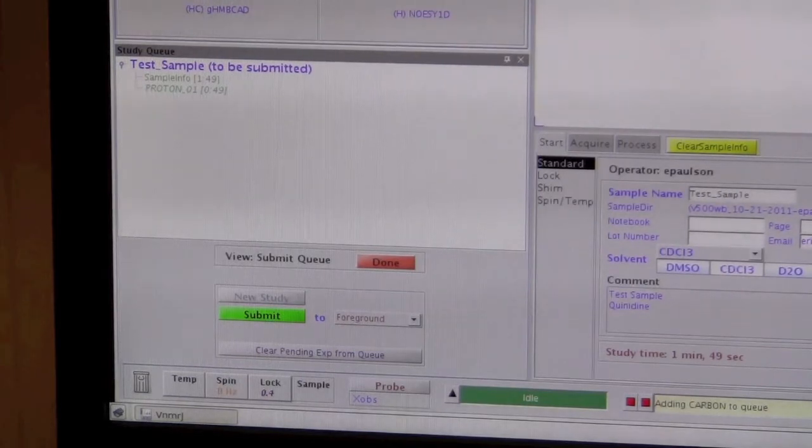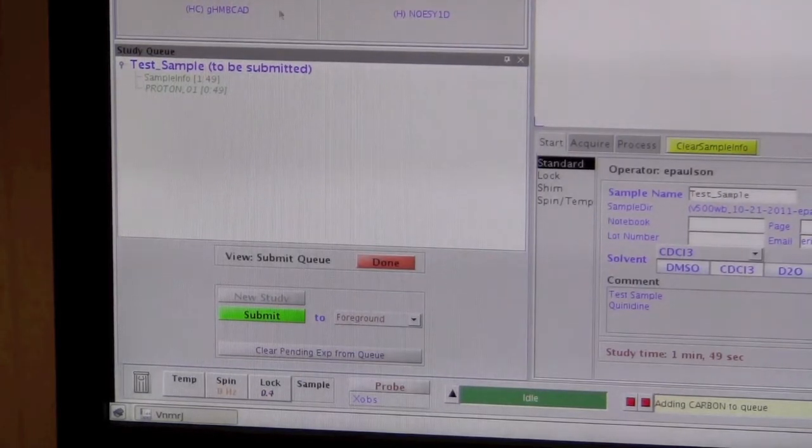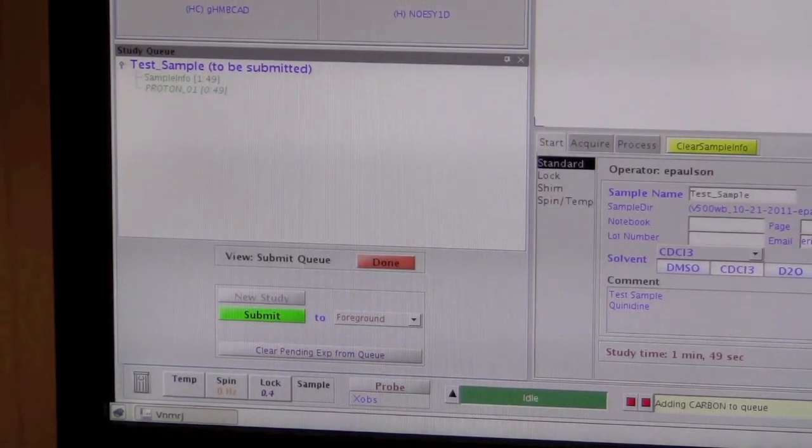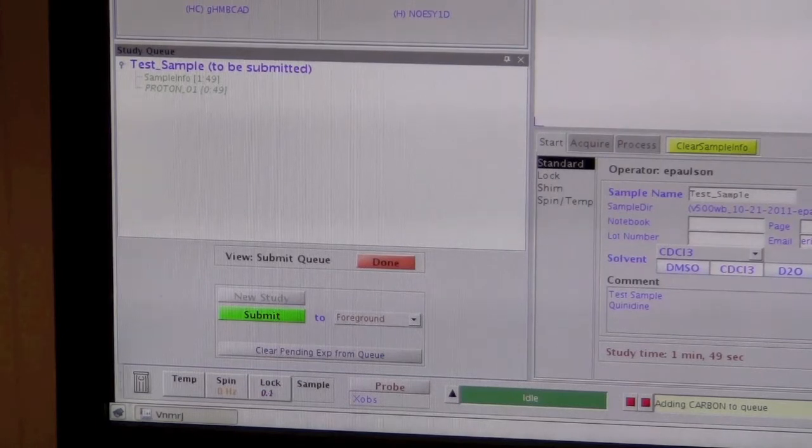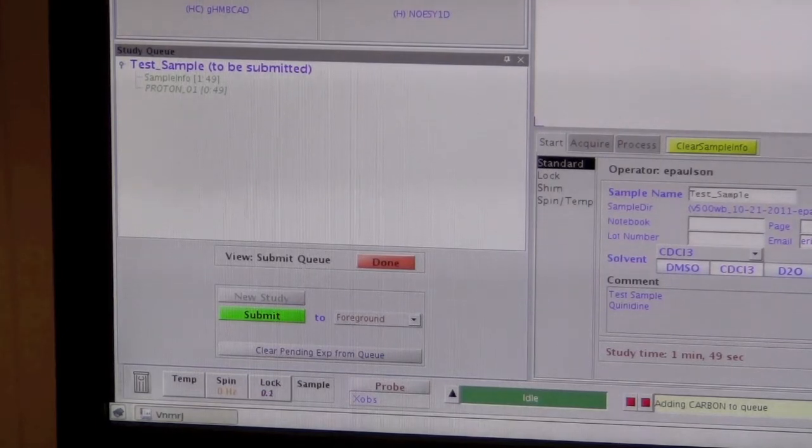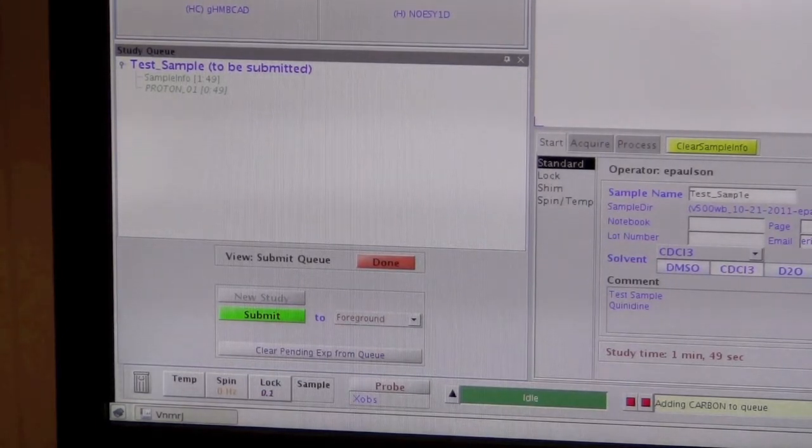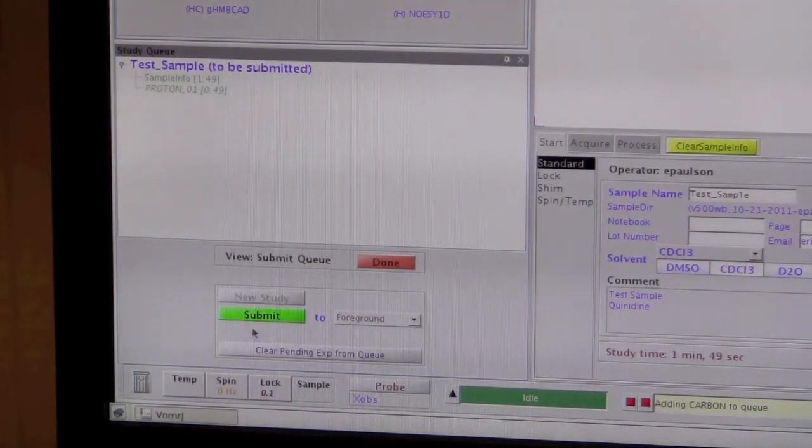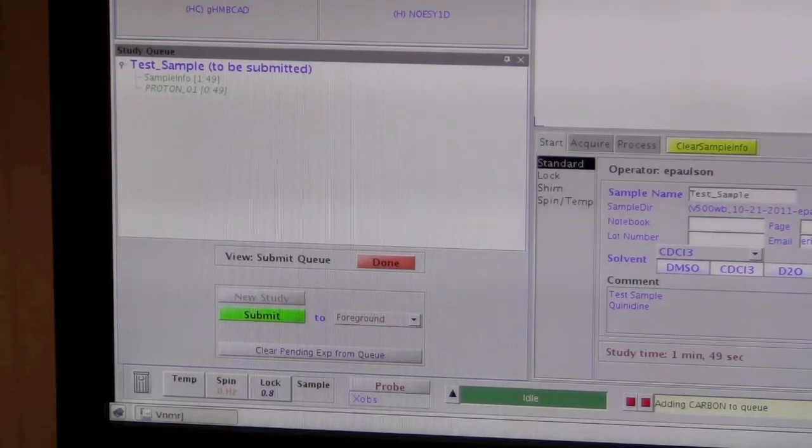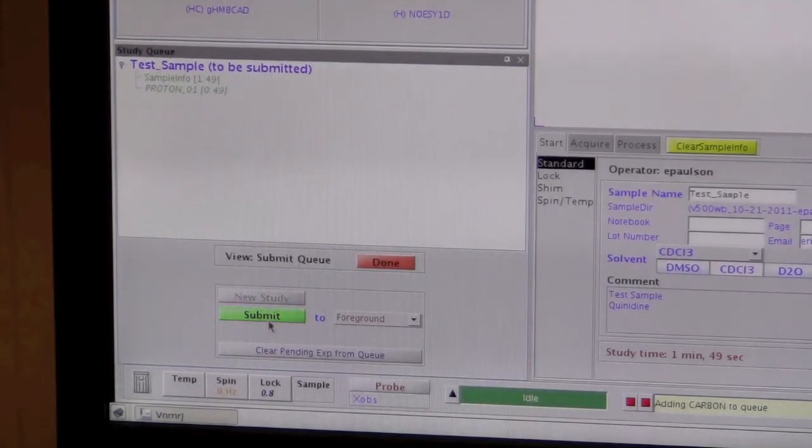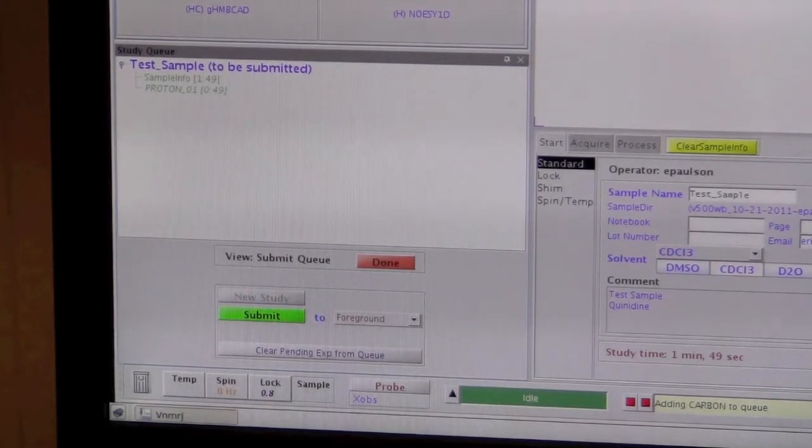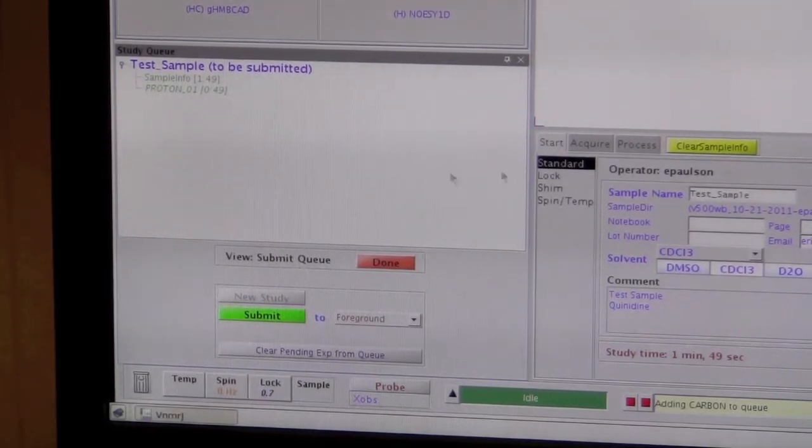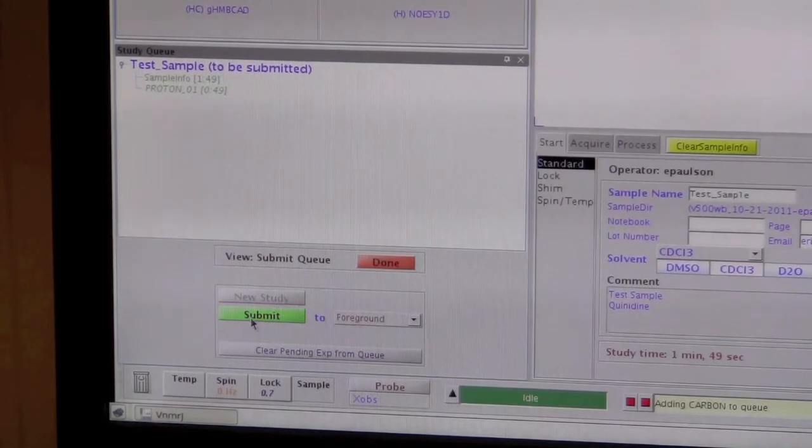One of the main differences between the Varian walk-up system and the Brooker walk-up system is that for Varian, you should put your sample in yourself before you submit. On the Brooker, you click submit, and then it will tell you to put the sample in. We have the sample in, so now we can click submit.